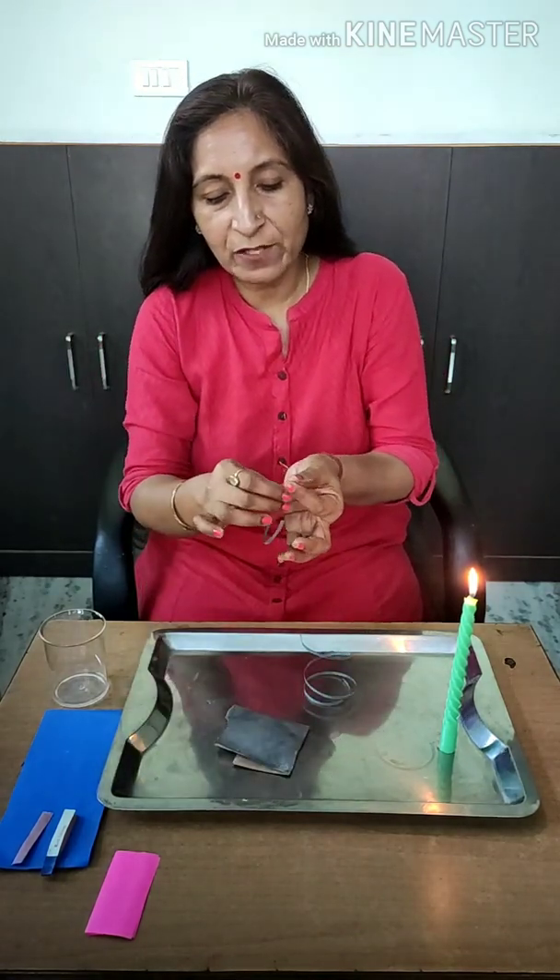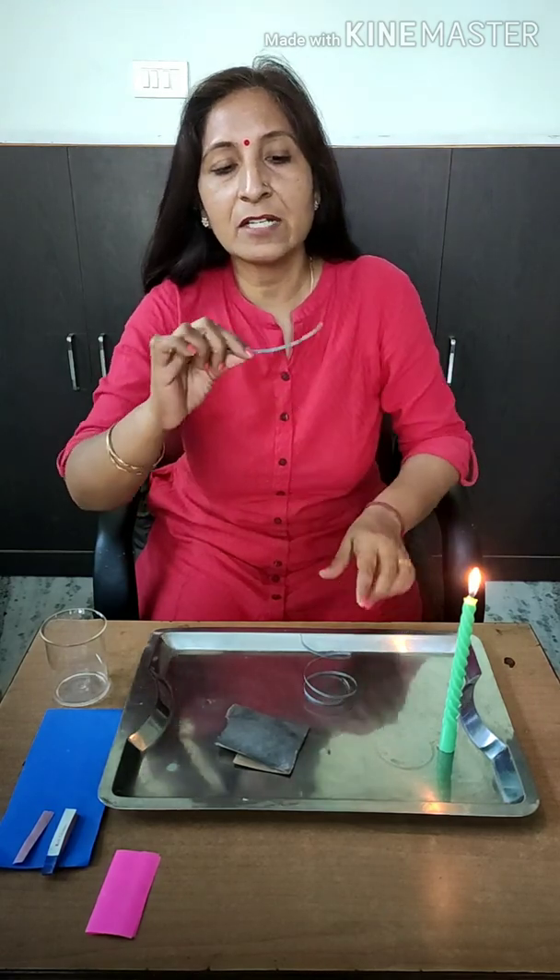So first we need to clean it with the help of sandpaper — only then we will get pure magnesium and we will be able to burn it. I have already rubbed a piece of magnesium with sandpaper, and you can see this part is looking so silver and shiny — that is pure magnesium.